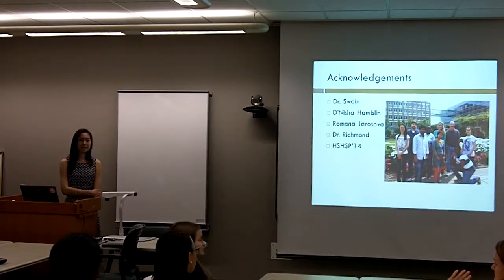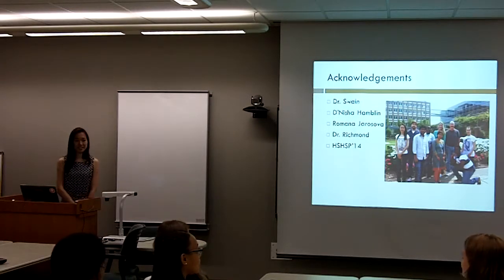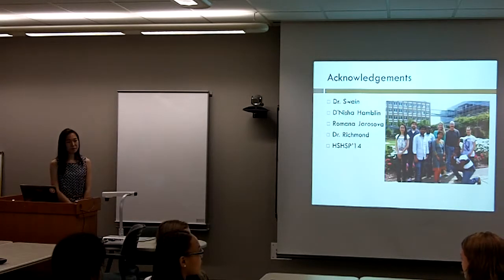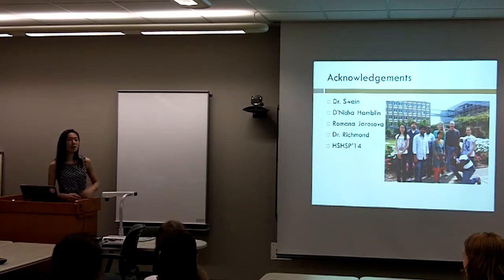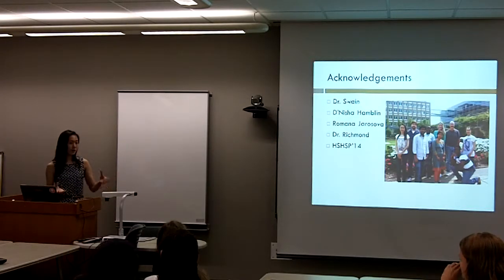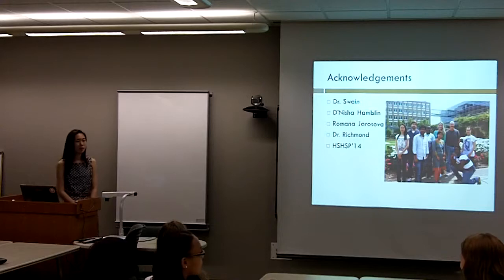Questions for Joy? Okay, so you said that propranolol is really important because it's a widely used drug. But why would you want to test it in somebody's urine? In case when it's excreted, or maybe that's how pharmaceutical industries might get the propranolol inside of urine samples. So we're just trying to replicate it as closely as possible.